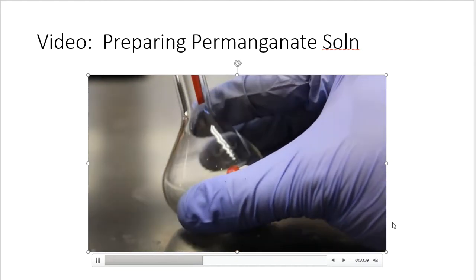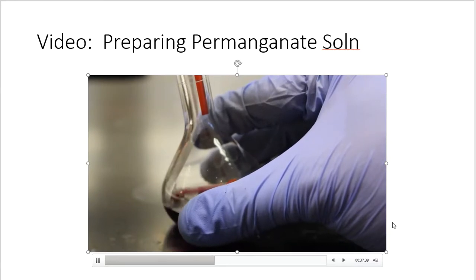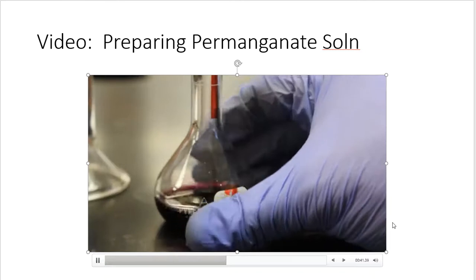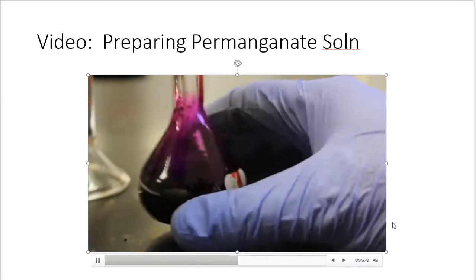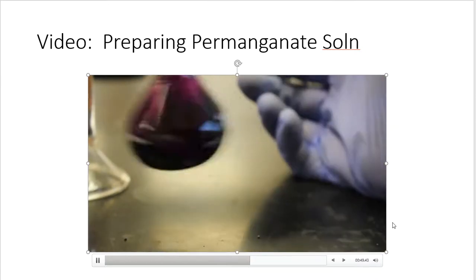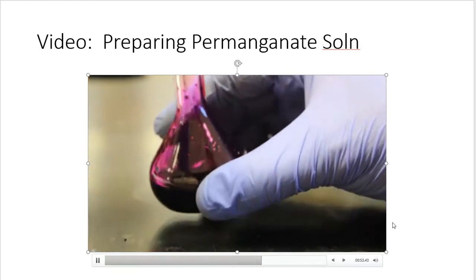All right, so now I'm going to add water because it says an aqueous 2% solution. So aqueous means water, of course, right? So I'm going to add a little bit of water to that solution. I'm going to give it a good mix. Maybe that purple is showing up a little bit better for you now, so that way you know I'm not lying to you. It wasn't black, it was really purple.